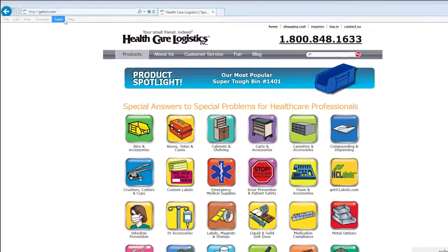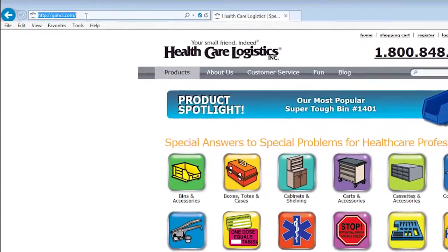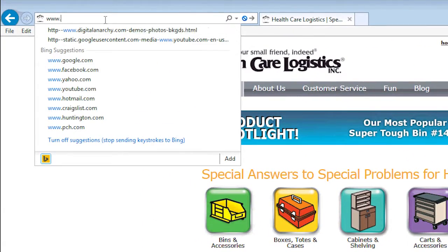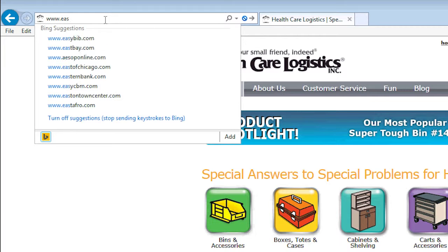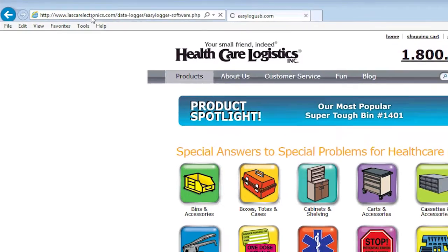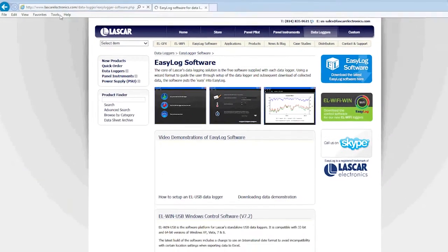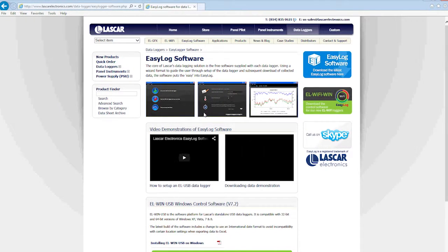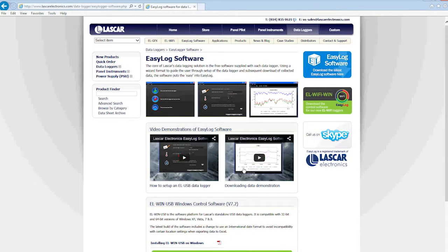Before you can begin using your USB temperature only data logger, you will need to download the software. Open your web browser and go to www.easylogusb.com. If you look at the web page, you will see additional videos on how to set up the data logger and download the data. There is also a file that contains instructions on how to install, but we will cover all of these procedures in this video.